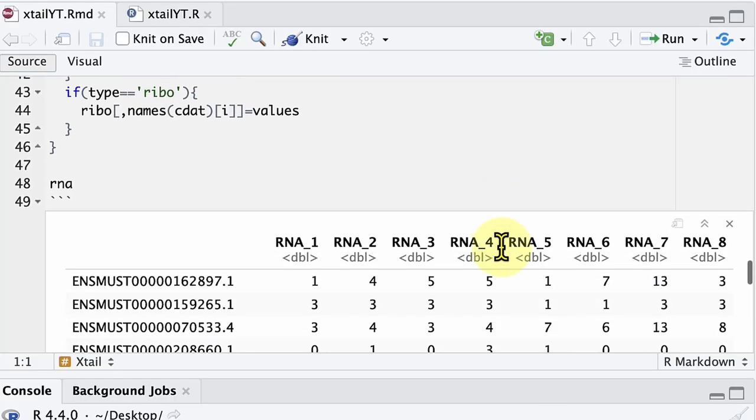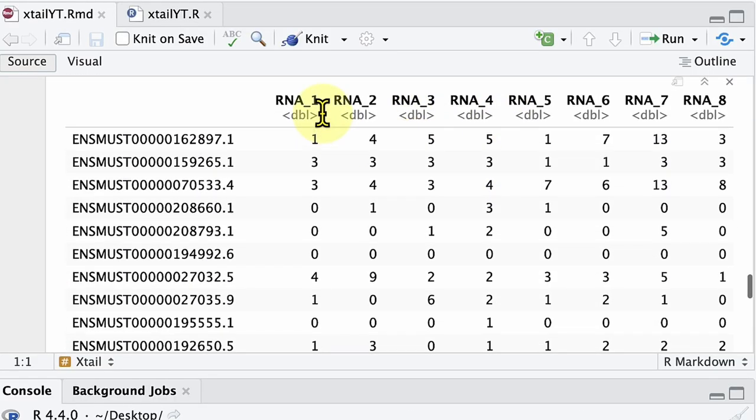Hi everyone, today I will show you how to analyze Ribo-seq data using XTail. First I will show you how to process the data to fit into XTail, and then we will use a one-liner to launch the XTail program using a Docker image.